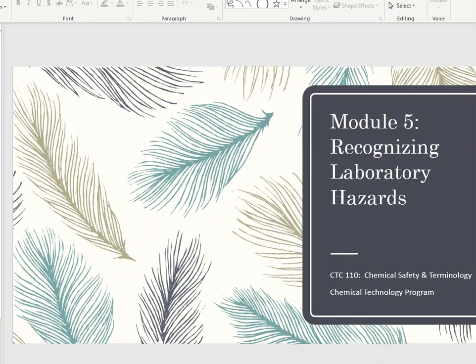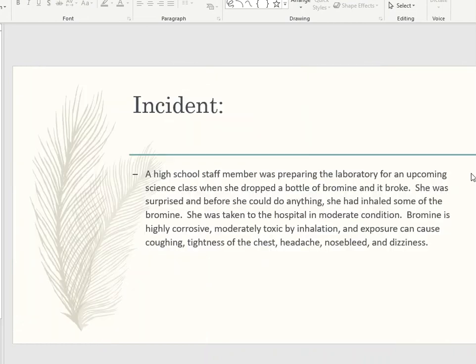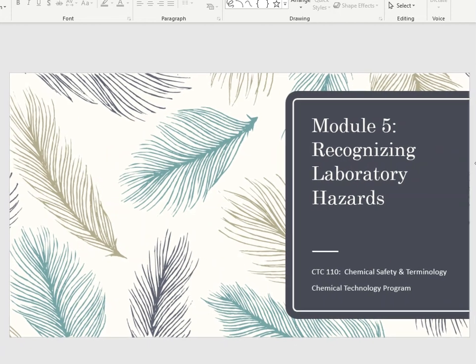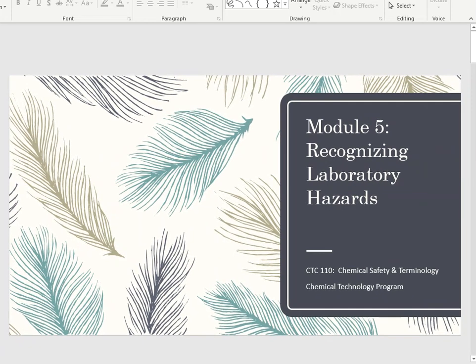We're off to a new lecture module, and this module is called Recognizing Laboratory Hazards. So you're probably scratching your head thinking, well, haven't we done this already? And the answer is, yeah, we have, somewhat at least, but we need to talk more details, right? The devil's in the details, and we need to get to those details.